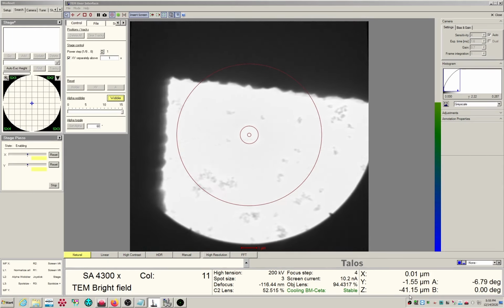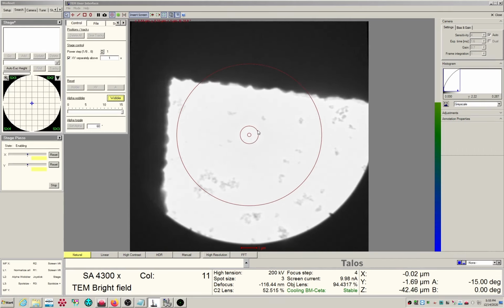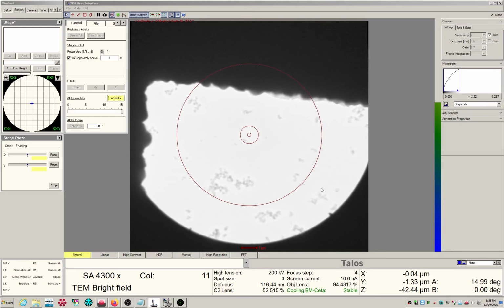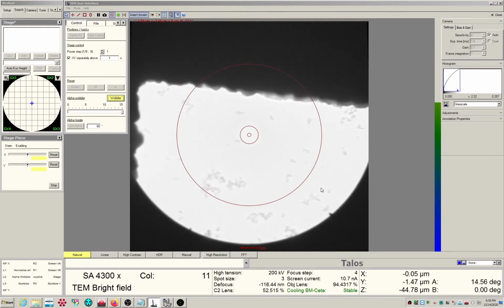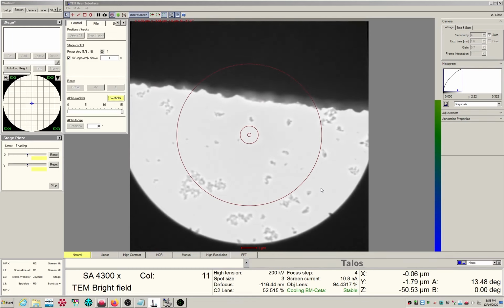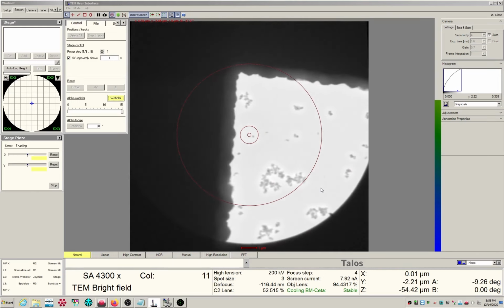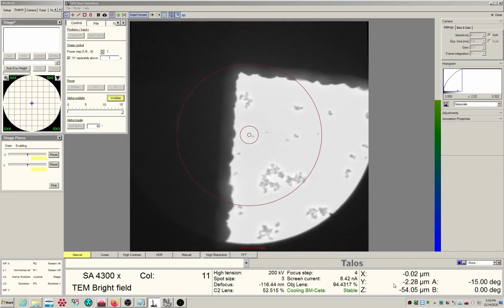Okay, I'm getting somewhere where the contrast of the rocking motion is much less, and the contrast of the particles is also less, more of a gray out. If I continue pressing, the contrast is getting more and more, and the rocking motion comes back. So I go backwards, plus Z. Right now the Z-axis reading is minus 54.